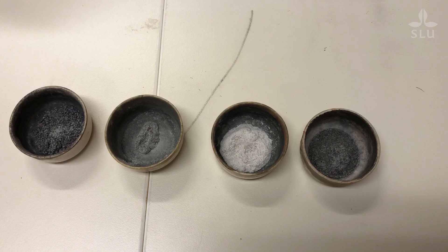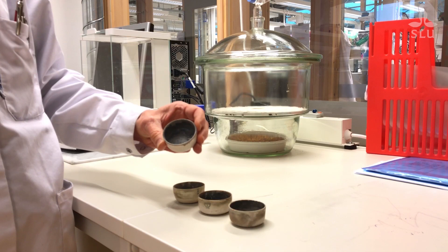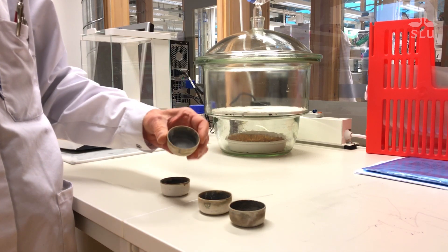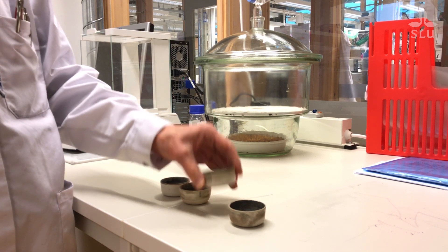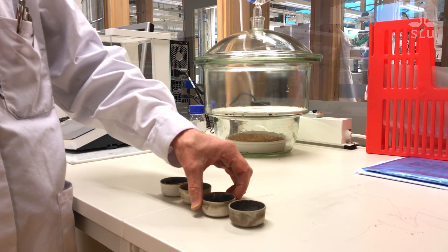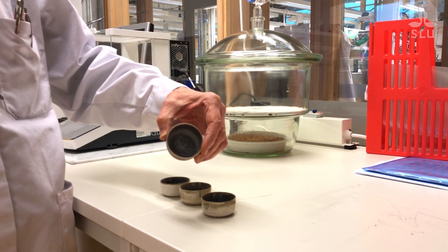This is the residue after burning all the organic matter. This is the rapeseed sample. Here we have the wheat — there's not very much left at all. The silage looks like this, and here we have the straw sample. Now we have all the weights you need to calculate dry matter and ash in all your samples. Good luck.